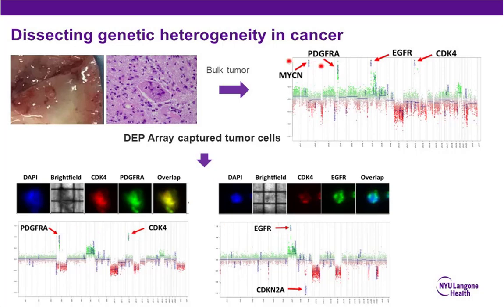You're still missing a population of MYCN amplified cells. So there is at least a third population of glioma cells in the background that we need to identify. One of the reasons we're unable to find this population is because we don't have really good markers to pick it up from the background.